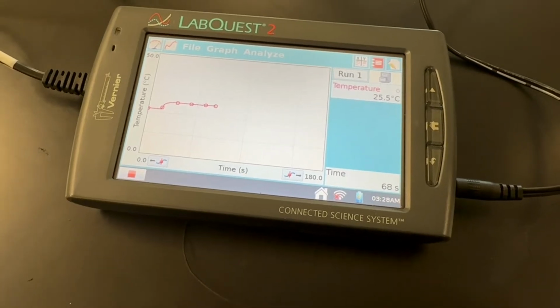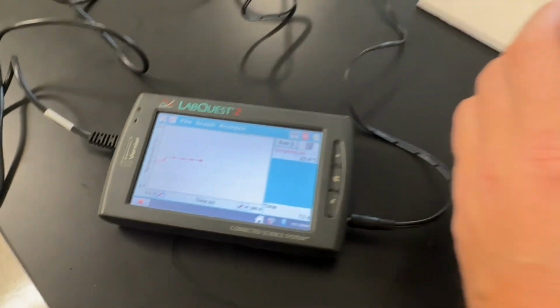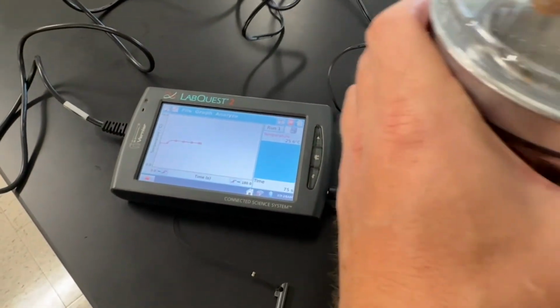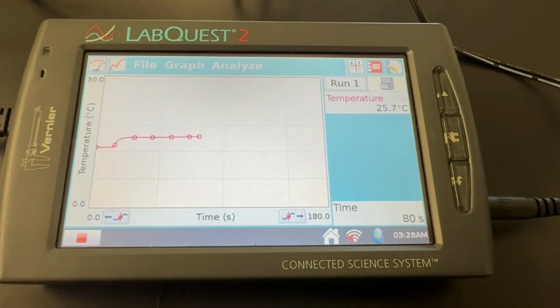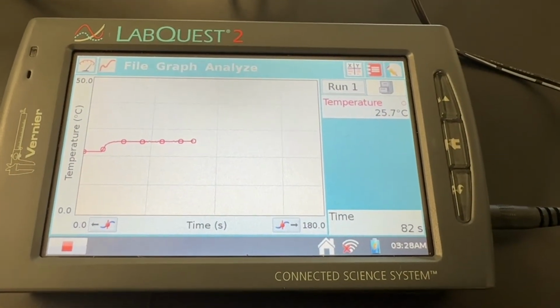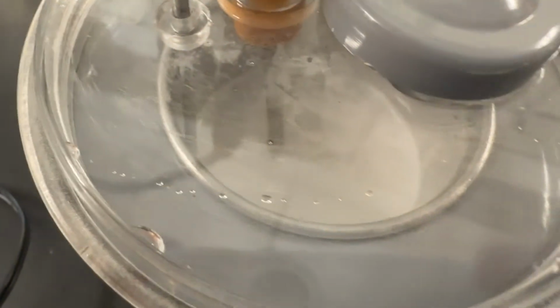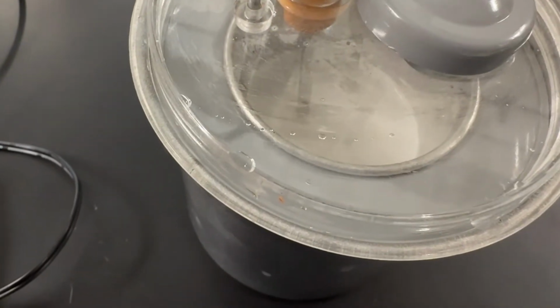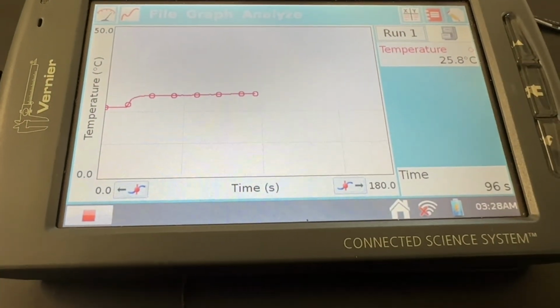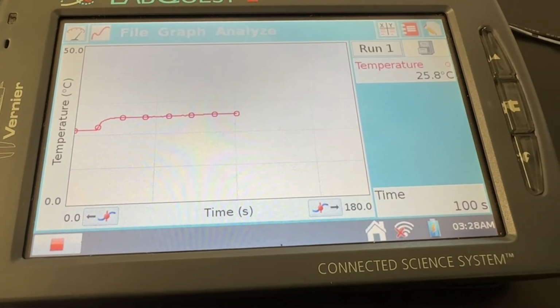Every now and again we'll need to give it a little swirl, just because our products start to settle. We want to make sure that this reaction completes fully. And just in case there was any confusion about my initial measurements in this video, we measured 50 milliliters and then we added the thermometers, so there was some displacement. It may have looked like it was slightly more than 50 milliliters of each of those reactants. So again, we are seeing a slow but steady change in temperature here. So we'll continue to monitor this.